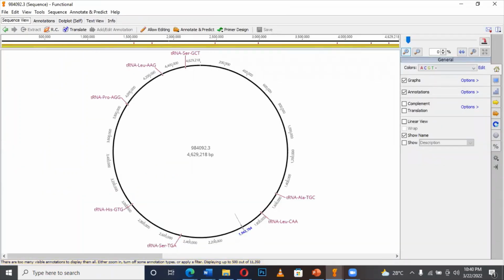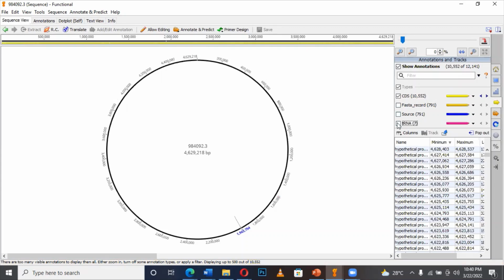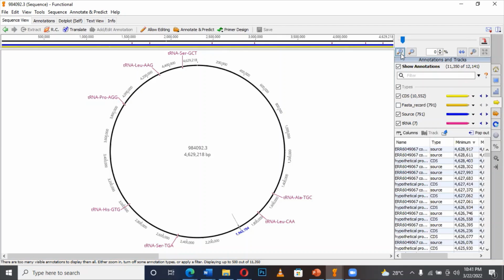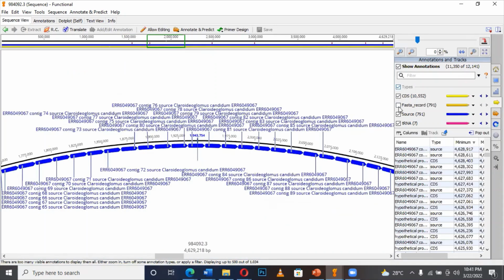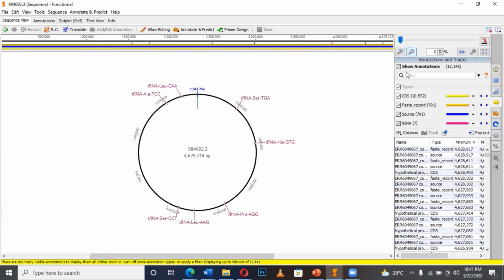Now the reason why we're viewing this way without viewing more of the annotation is because there's so many of it there, right? And the sequence itself is so long. Can you see? It's really long. Let's click, and if you try to zoom, we have more of those features. Can you see? So this is another way you can visualize.